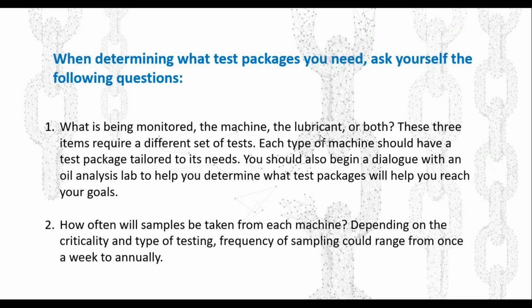Today we're mostly going to be focusing on the oil analysis tests that are used, but something to keep in mind to have an overall view is the location of the sampling port, or where you're pulling the sample from, the criticality of the machine, frequency, target and alarms development, and even selecting a lab. We're not going to go into all of that today. I'm going to save that for another time, but we're going to be focusing mostly on the tests.